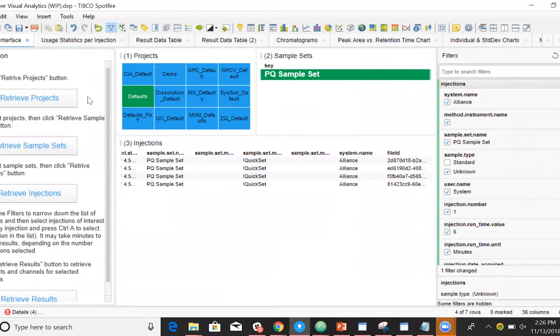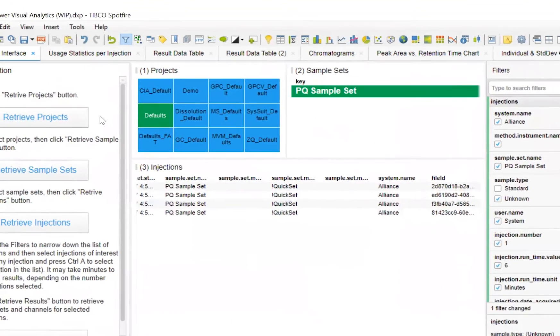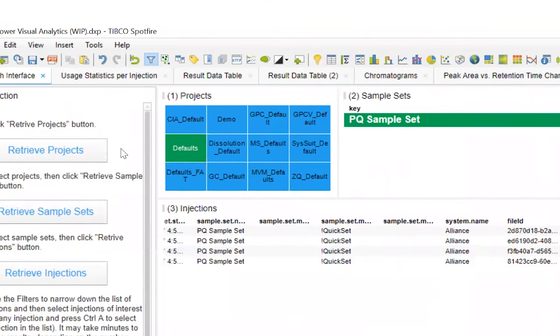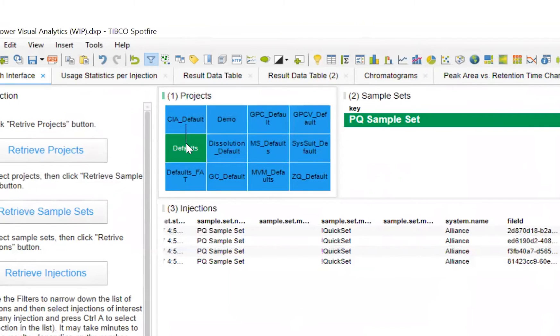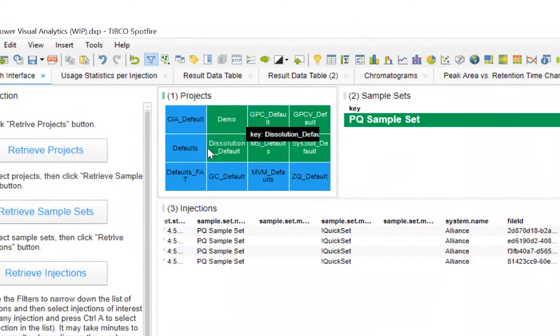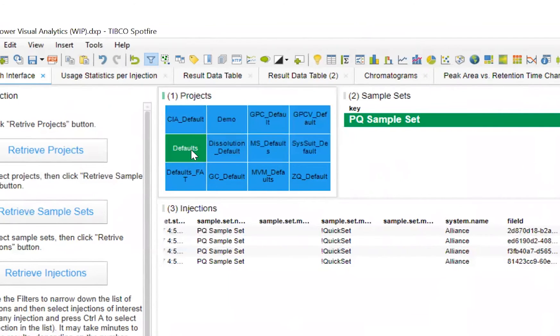Now, this template could be used by scientists to retrieve all the projects within Empower. These projects will appear in the project section of our template. We have the ability to choose as many projects as we like. Projects could come from different sites, or they could have similar products.